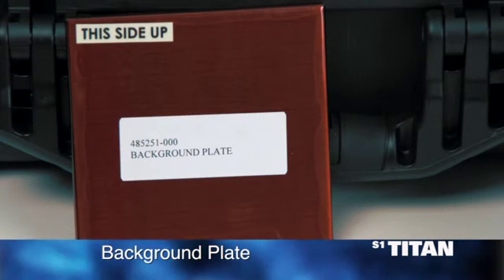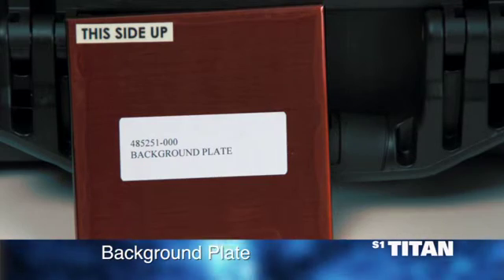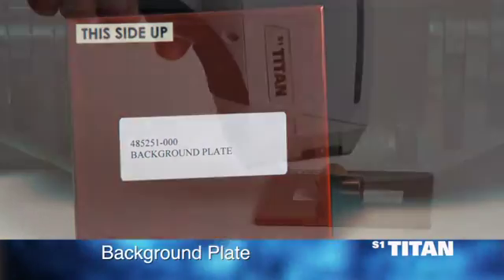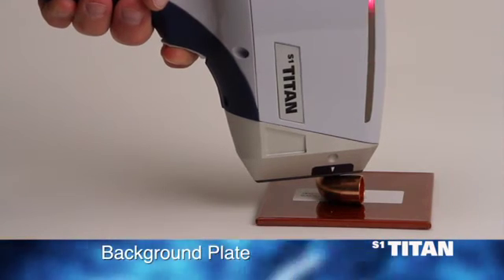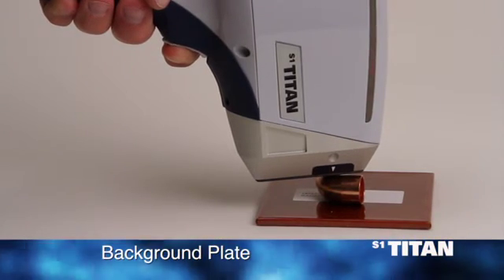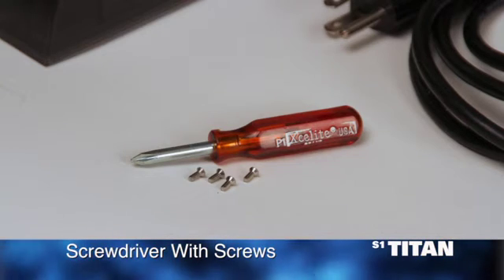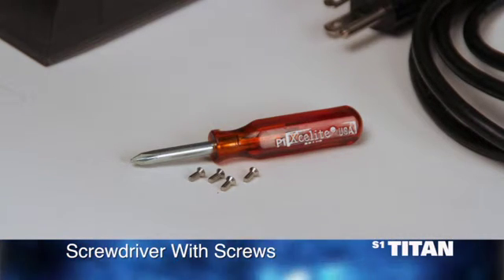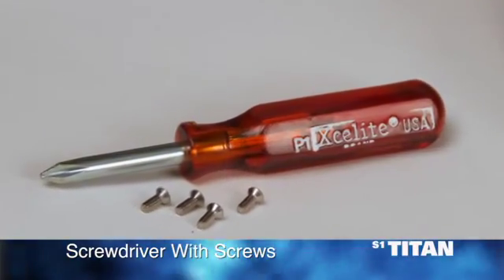The background plate should be used when analyzing small samples, thus eliminating interference from other materials behind or around the sample. The plate also absorbs X-rays, providing additional safety from X-rays that might otherwise penetrate the desk, table, or other surface. A Phillips screwdriver for removing the nosepiece standoff. The standoff must be removed to replace the protective window.